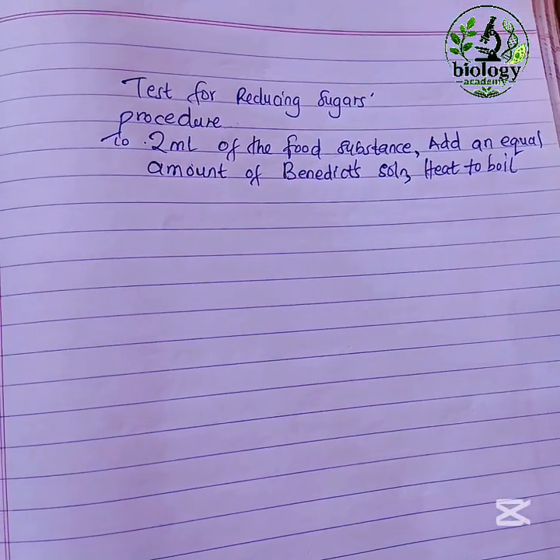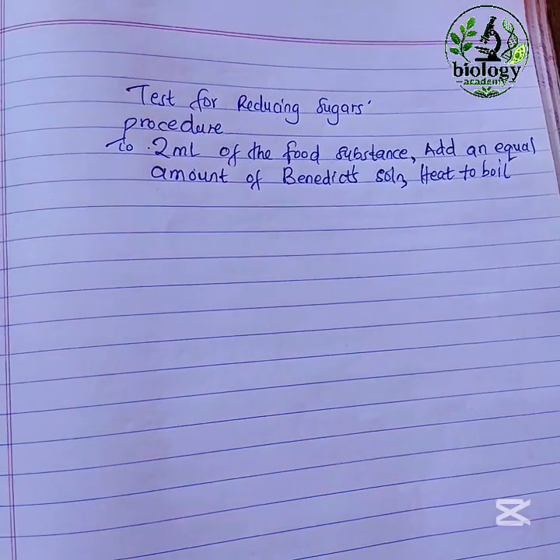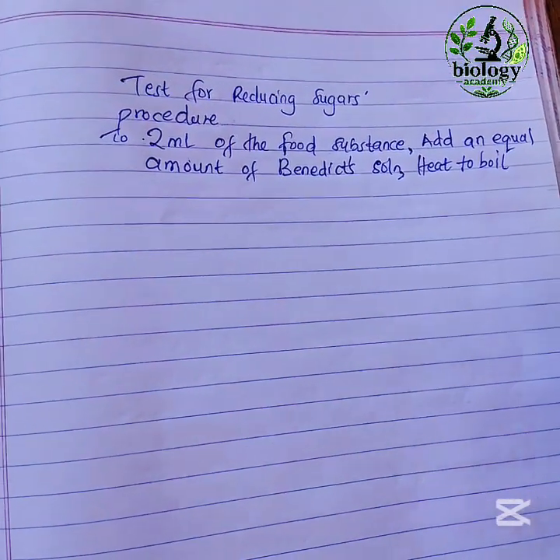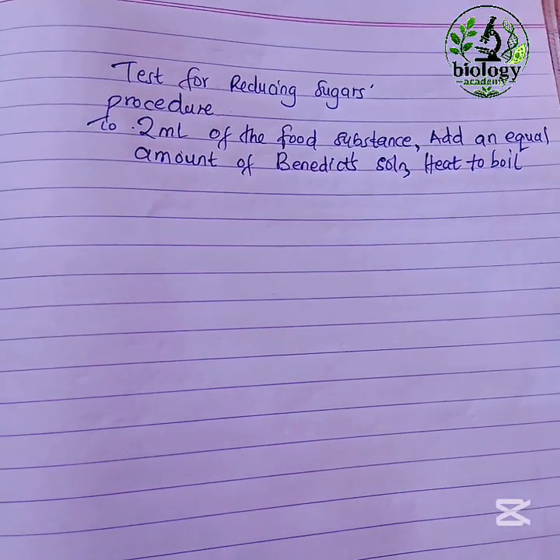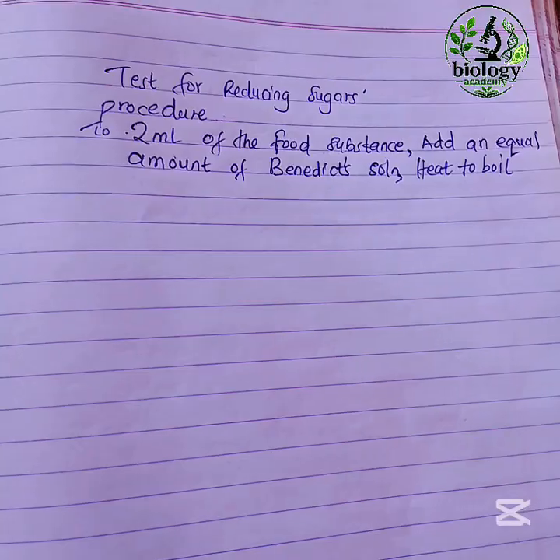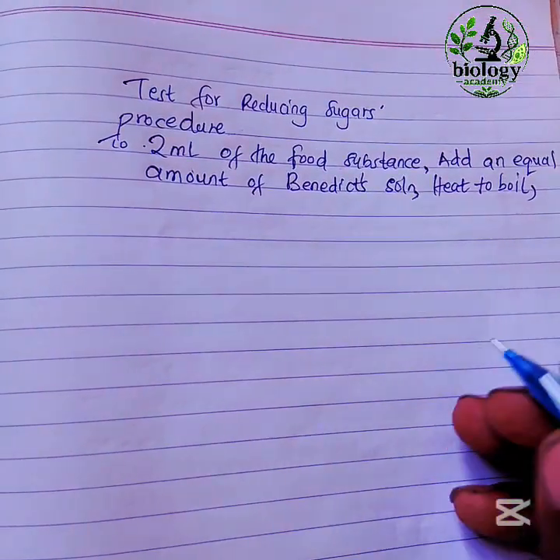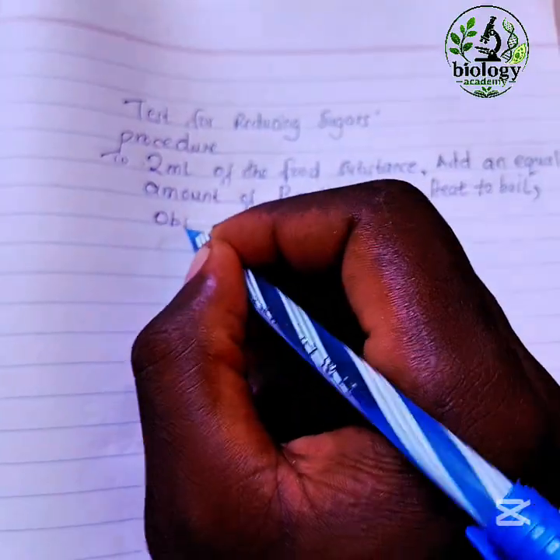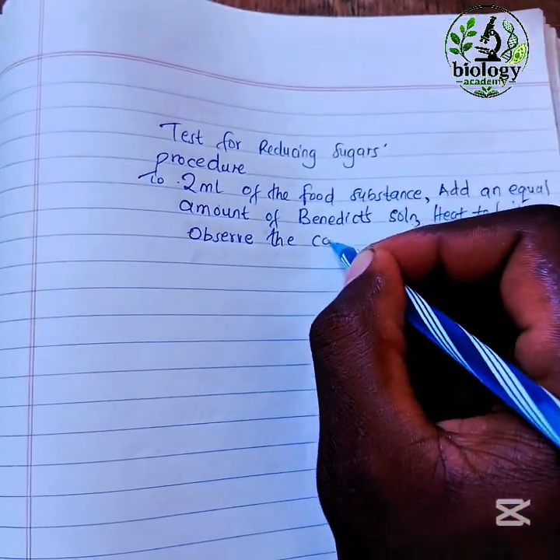If the color was supposed to change from green to yellow to brown, it changes from green to yellow only, because you never gave the reagent time to heat together with the food substance to boil. So make sure you heat to boil, and then observe the color changes.